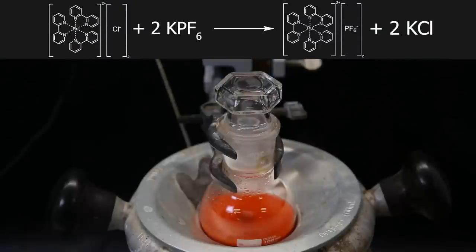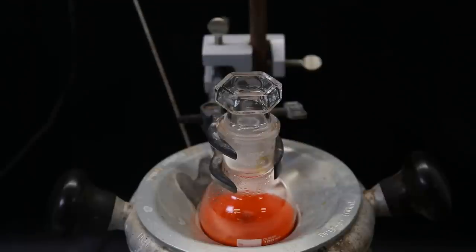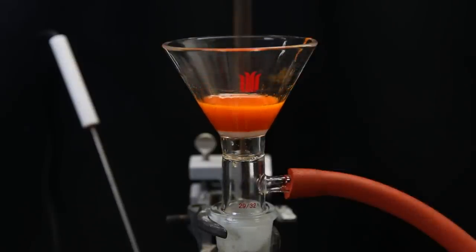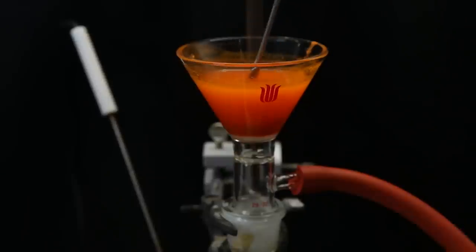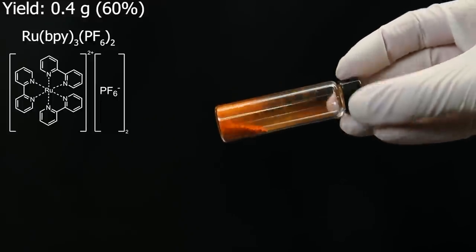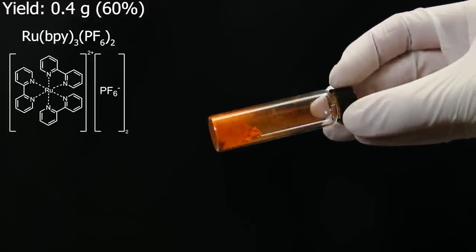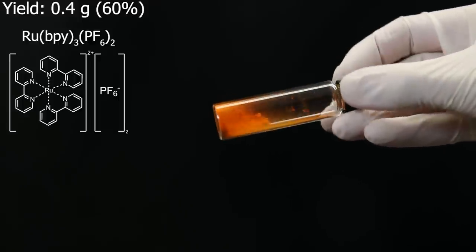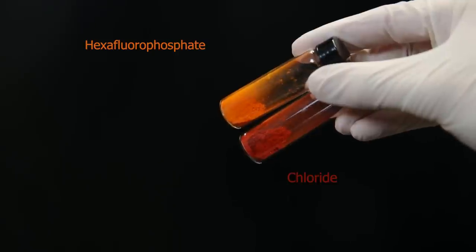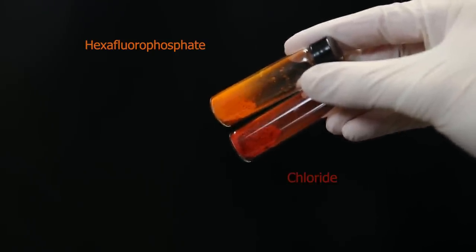In this simple reaction, the chloride ions are replaced by hexafluorophosphate ions to produce the hexafluorophosphate salt of the ruthenium bipyridine complex. When that is done, I let it cool down to room temperature and then filter it through a glass-fritted funnel. I wash it several times with a bunch of water to remove all of the potassium hexafluorophosphate, and then once with ethanol and ether. When that is finished, I am left with 0.4 grams of tris(bipyridyl)ruthenium(II) hexafluorophosphate, which is a yield of 60%. The conversion should be pretty much 100%, but it's easy to lose a large percentage when working with such small amounts. Side by side, we can see how much the color has changed compared to the chloride.